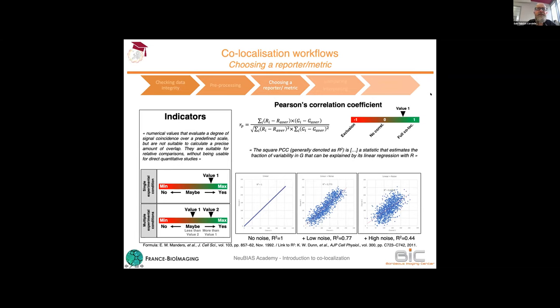But enough categories. Let's jump into the generic indicator that everyone is using. Let's talk a bit about the Pearson correlation coefficient. This might be scary, and you can skip it. You just have to keep in mind that the Pearson coefficient is simply an indicator of how well the cytofluorogram, where intensities from channel 1 and channel 2 serve as coordinates, looks like a line.